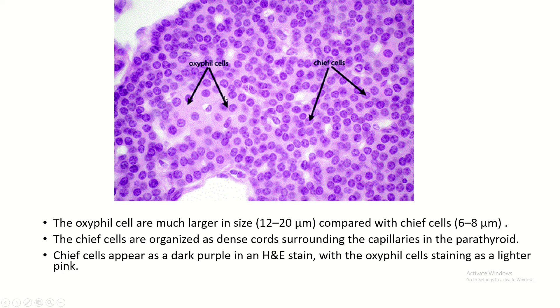This is the H&E stain image of the parathyroid gland. This is the oxyphil cell. Oxyphil cells are much larger in size, 12 to 20 micrometres, and chief cell diameter is 6 to 8 micrometres. And in H&E stain, oxyphil cells stain light pink and chief cells stain dark purple.